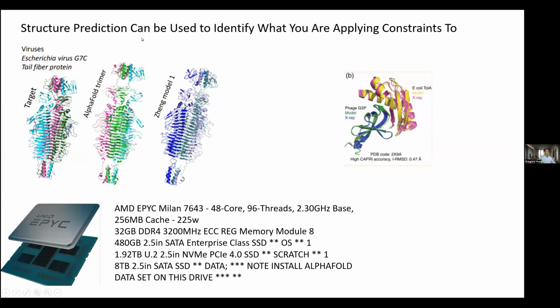So I mentioned to you that it's nice to know what you're applying your SAXS extracted constraints on. And so, AlphaFold's a very good thing to do that with. So here's, let's say, the target structure. This is the best AlphaFold trimer that was extracted from the sequence.